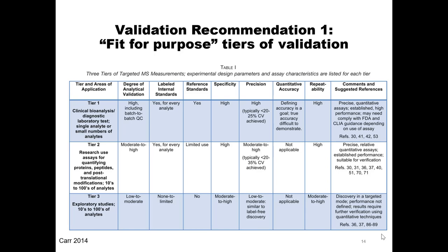I would also say that I think this was kind of drawn up before DIA got really big, and the tens to hundreds of analytes was pretty much the limit of what you might be able to do with most targeted experiments. Now I think we're definitely pushing easily past the tens of thousands of analytes and doing fairly rigorous quant on them. So these will probably have to get redrawn once DIA becomes more mainstream.